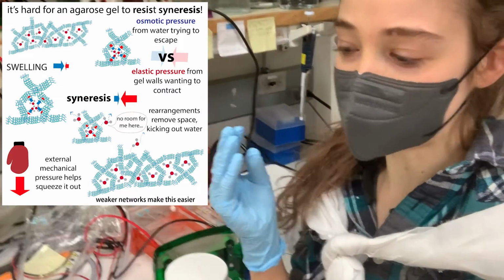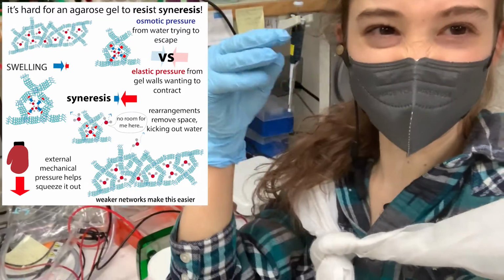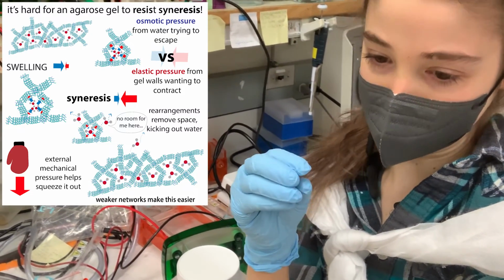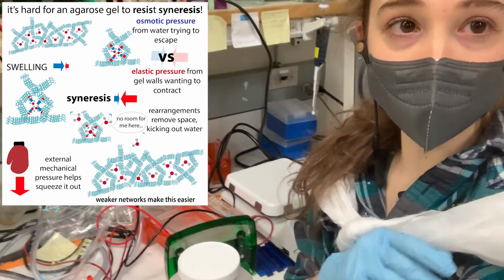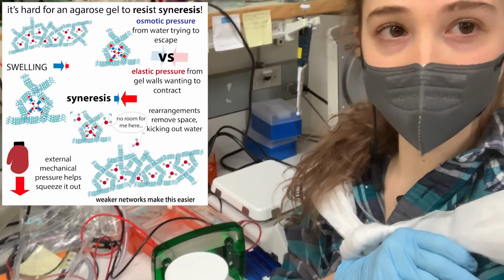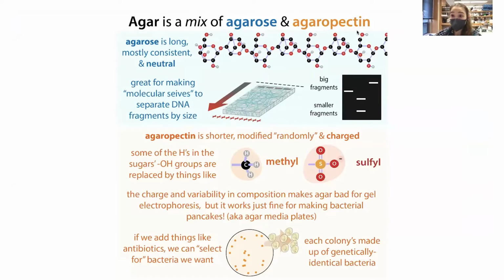There's also this thing called syneresis, which you might have seen if you've had a cheesecake or something, and after it gets liquid on top and it kind of shrinks down. You can think of that as the gel rearranging itself a little and pushing out a little water. And these agarose gels can do that too. So there's some cool stuff to talk about with agarose. Let's start with what agarose is not.